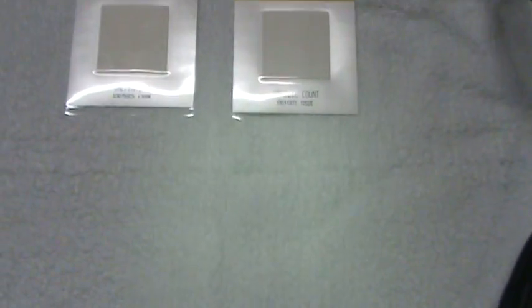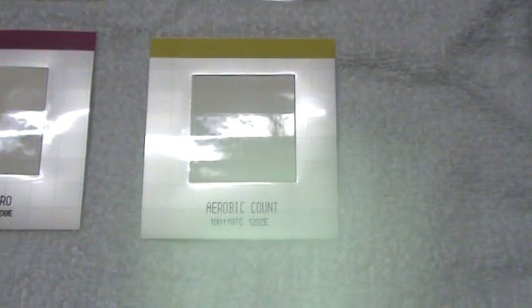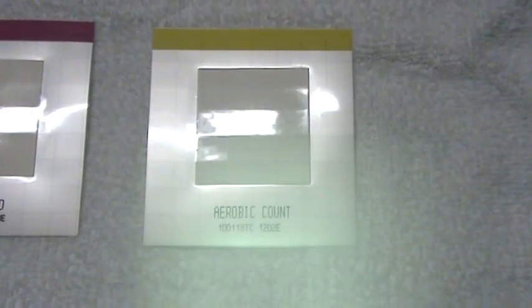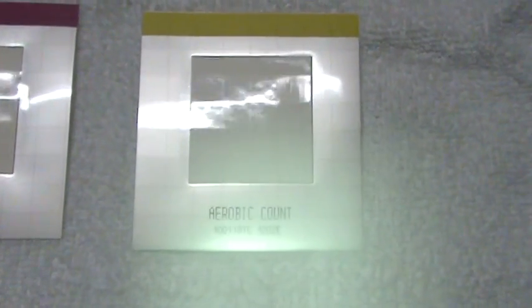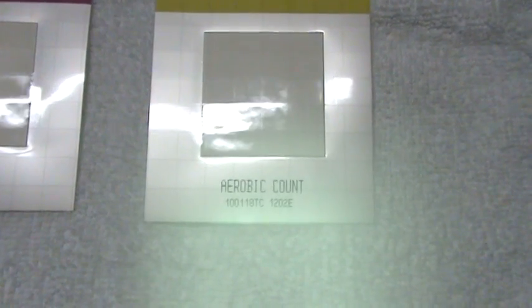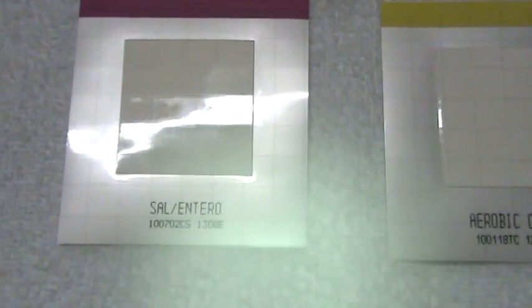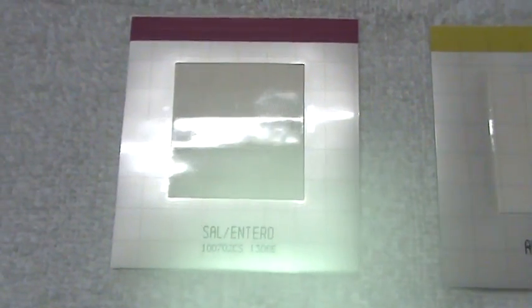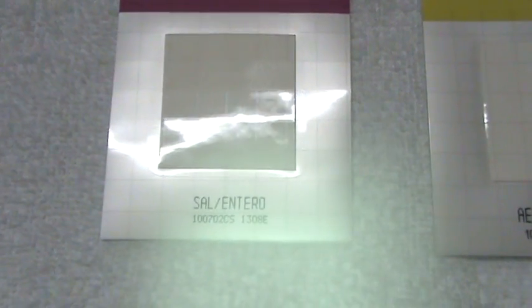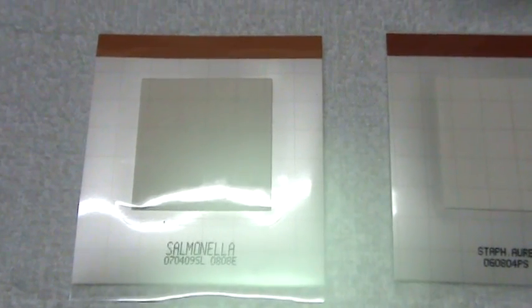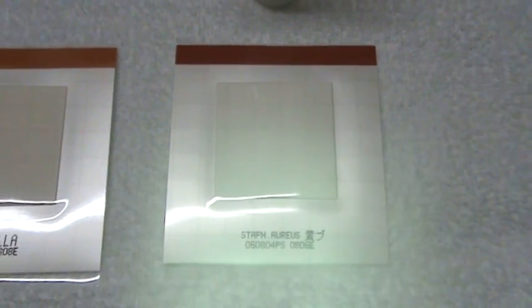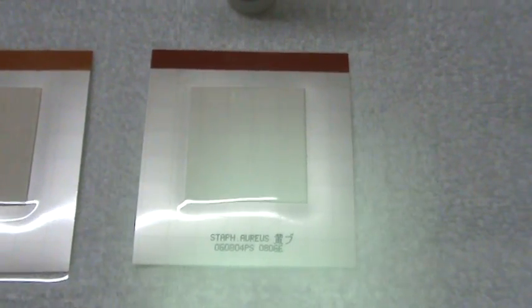We are going to make a video about taking total bacteria count. All ingredients needed are slides. This one is for aerobic count, Enterobacteria, Salmonella bacteria, and Staphylococcus aureus bacteria. I don't know if I am pronouncing it all very well, but those are called slides. That is where the bacteria grow on.